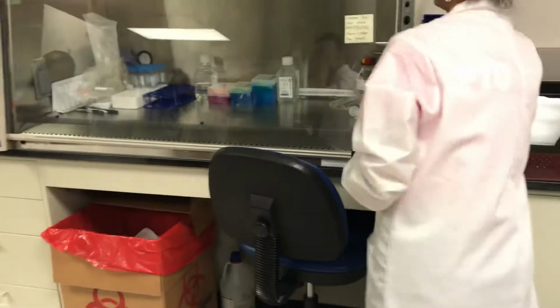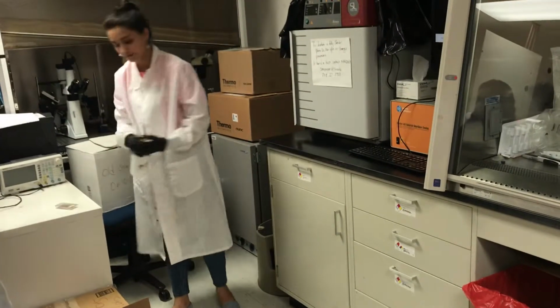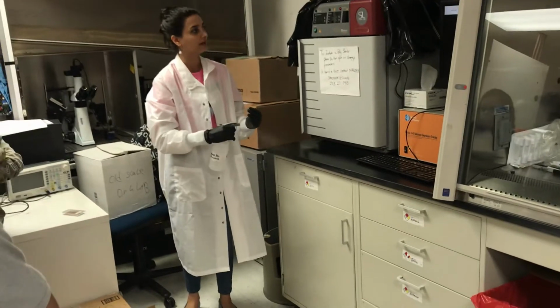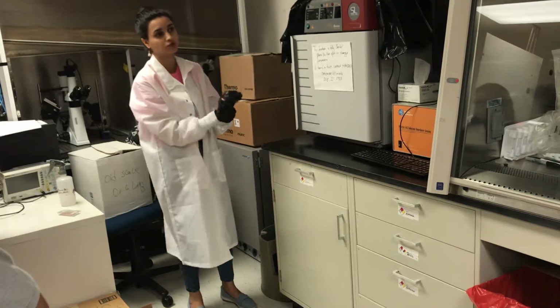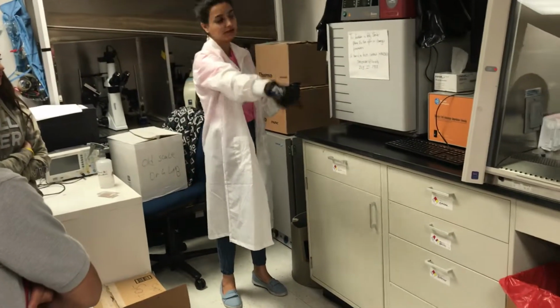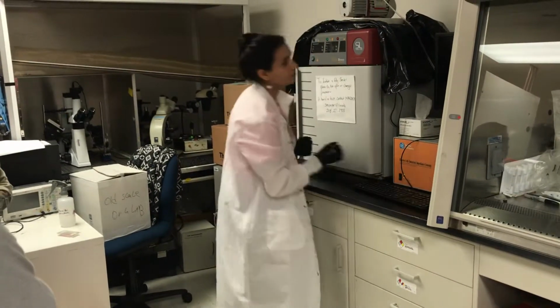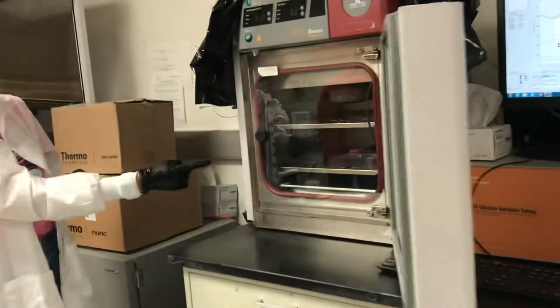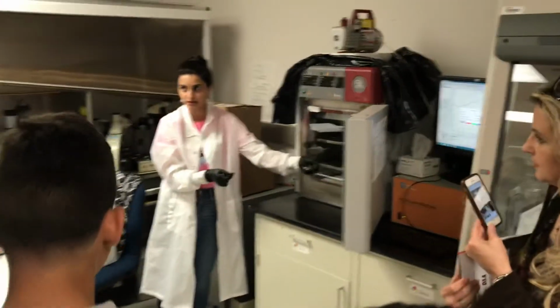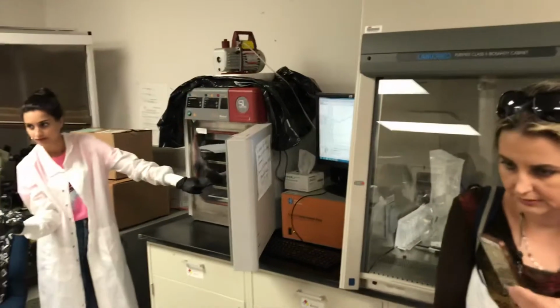Let me grab this. So this is a fully sterile environment. So every time that we want to go in and out, we have to spray our hands with ethanol to make sure that everything is super sterile. We make the cells under that, and then we put them inside here for growing. So what I wanted to show you was a recording that we're doing right now. You see that device in there, the chip that I showed you gets connected to that thing, all right? And then we close it. You guys can move here more to see it.